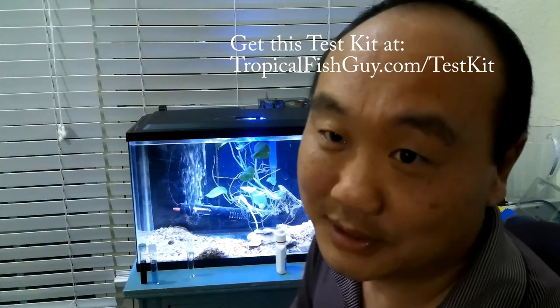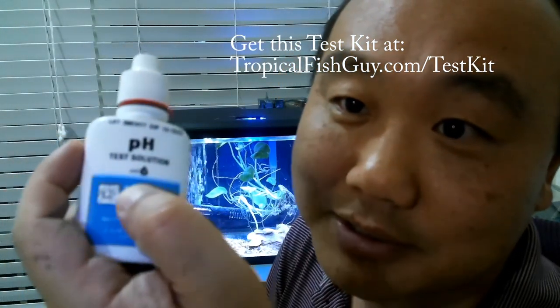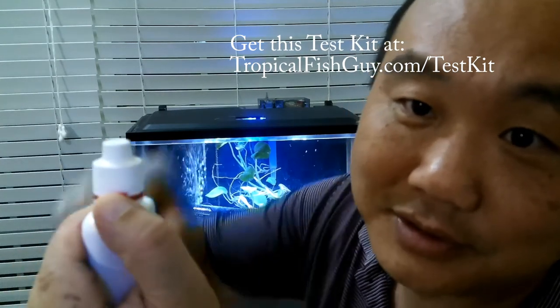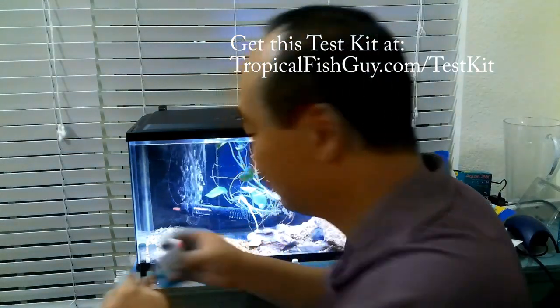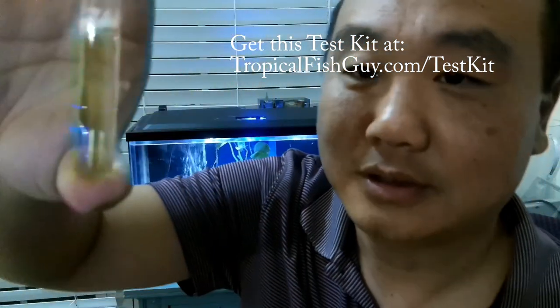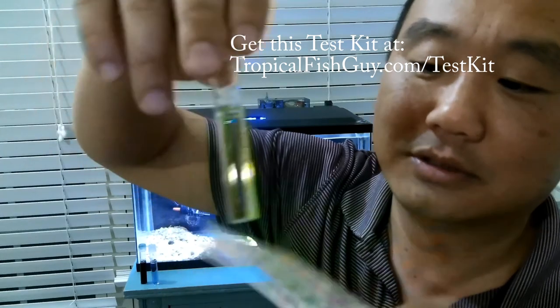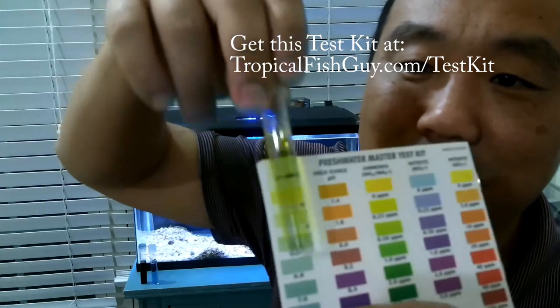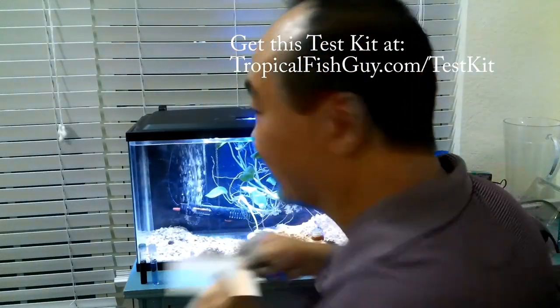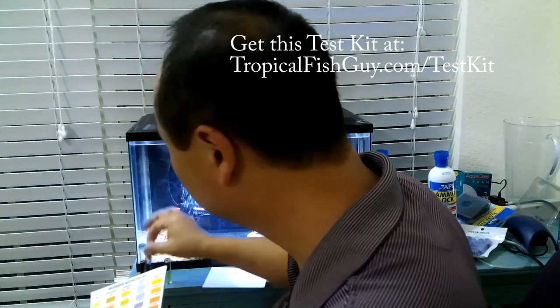Finally, the last test is pH to check the alkaline acidity. You add three drops from the pH bottle — hold down the red cap, turn it, one two three drops. Put the cap on and look at this — pH is low, low, low. pH is reading 6, actually lower than 6. Shouldn't be yellow like that.